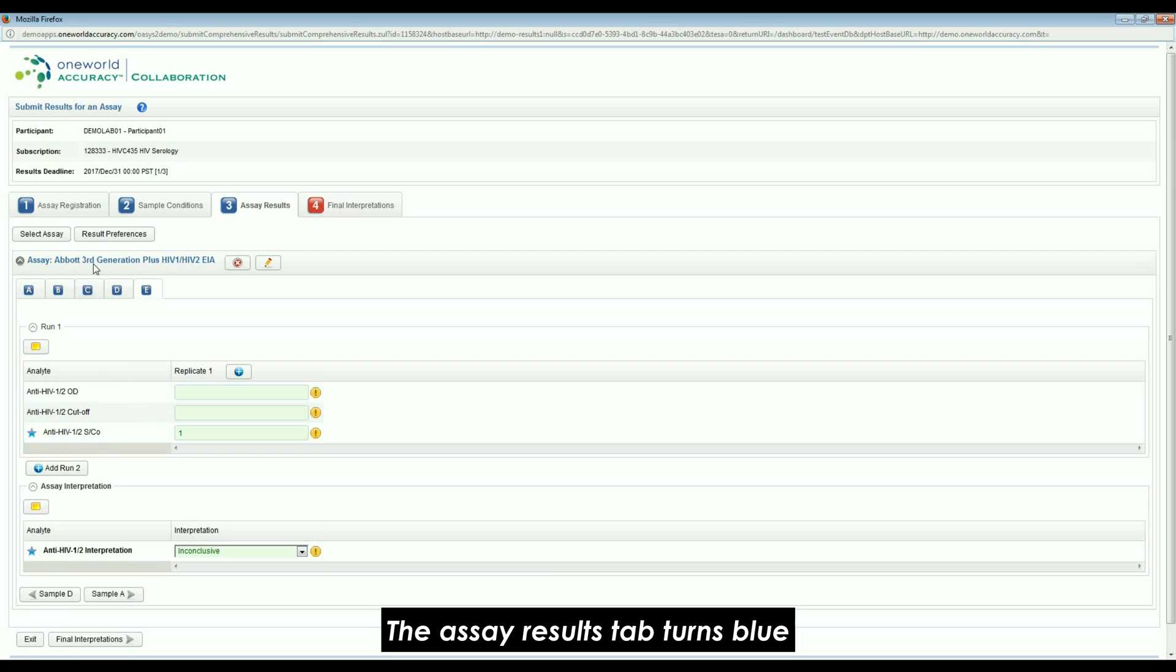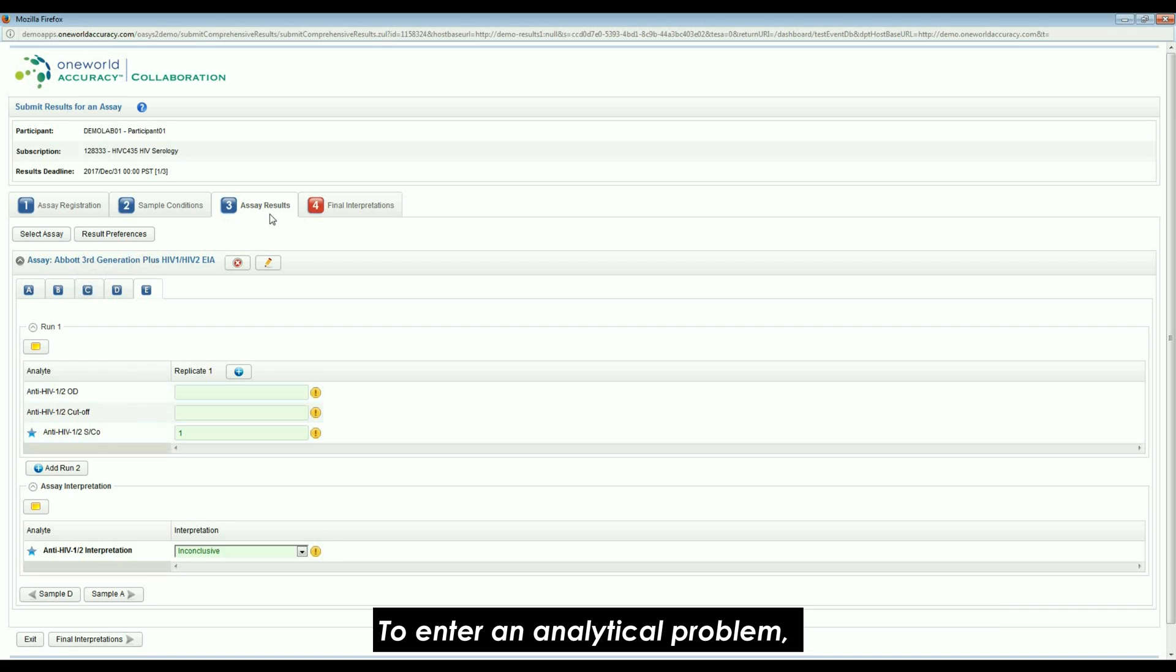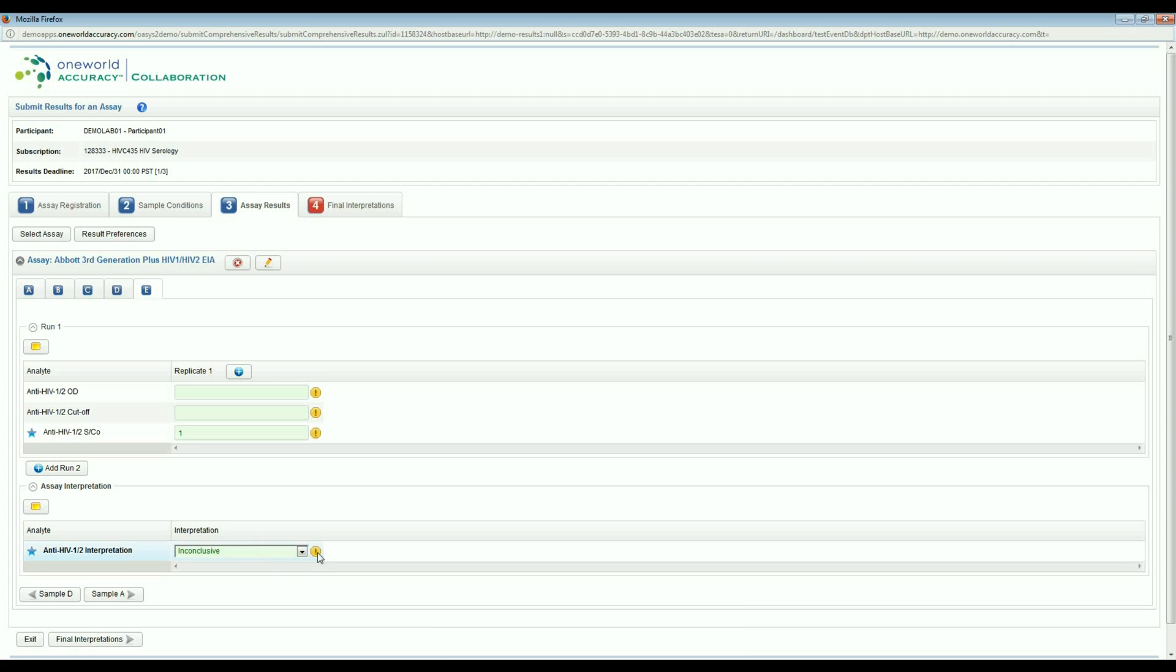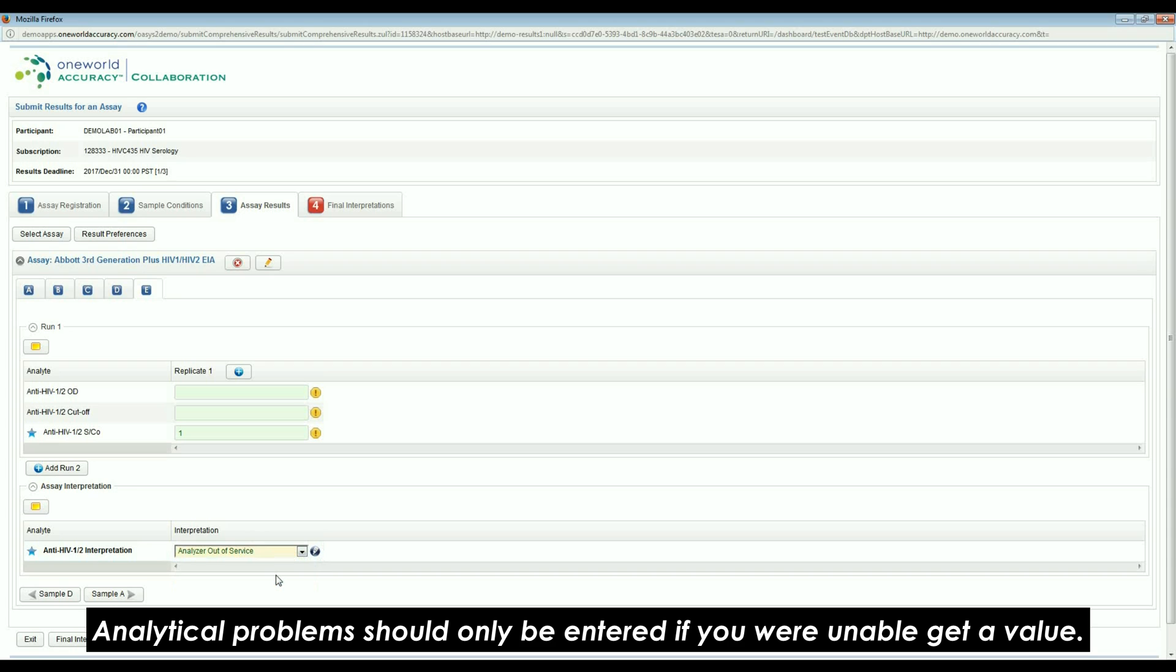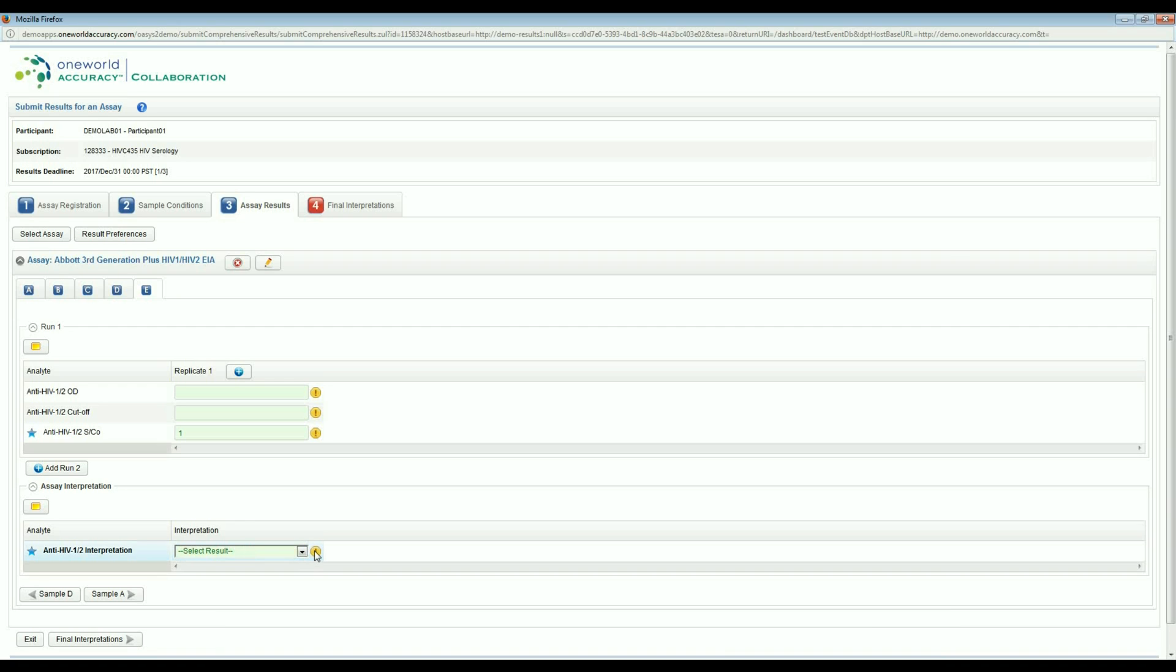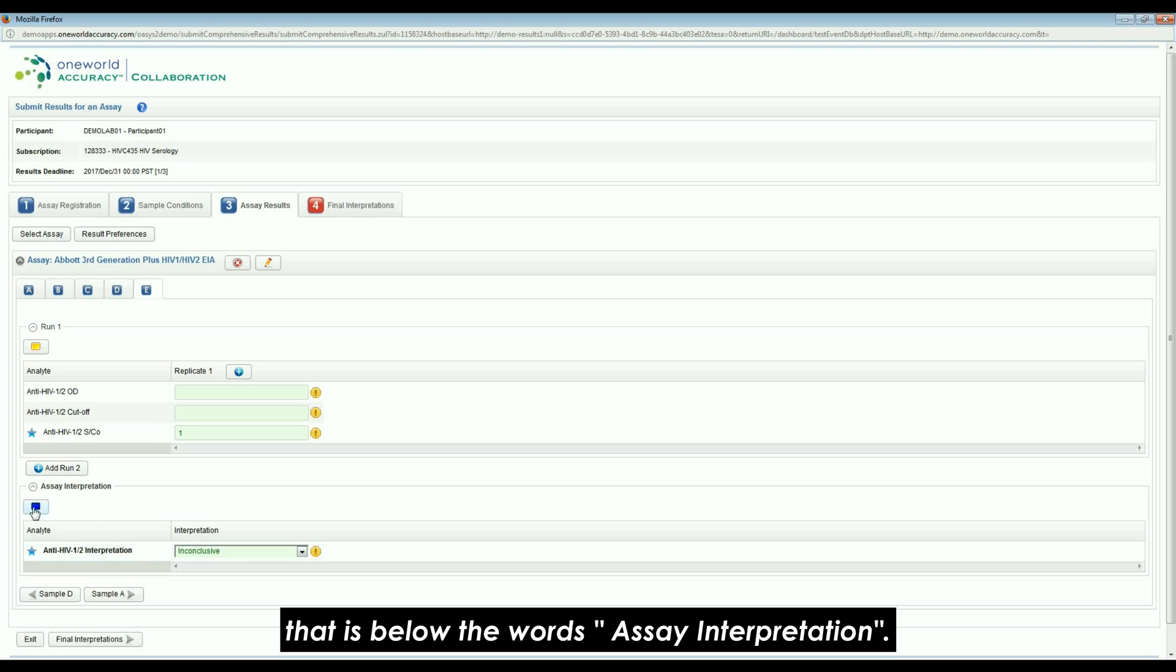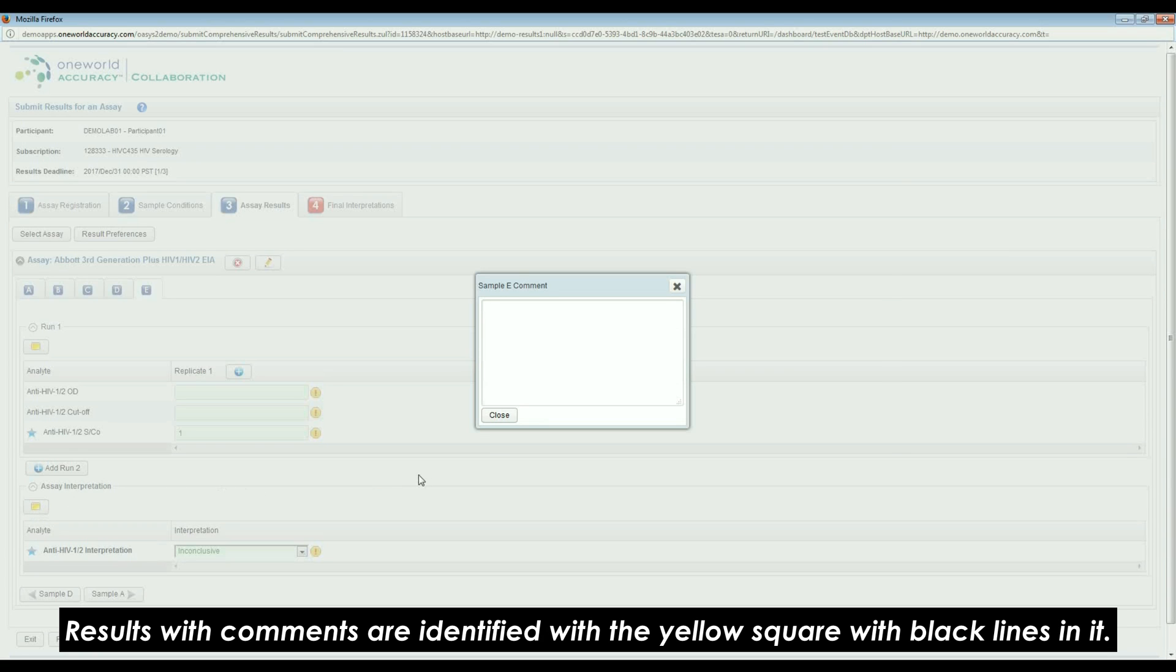The assay name turns blue when all mandatory results have been entered for an assay. The Assay Results tab turns blue when all mandatory results have been entered for all assays. To enter an analytical problem, click on the yellow exclamation sign that is located to the right of the results window. Analytical problems should only be entered if you are unable to get a value. Click on the pencil if you wish to enter a result instead. If you have a comment, please click on the yellow square that is below the words Assay Interpretation. Results with comments are identified with a yellow square with black lines in it.